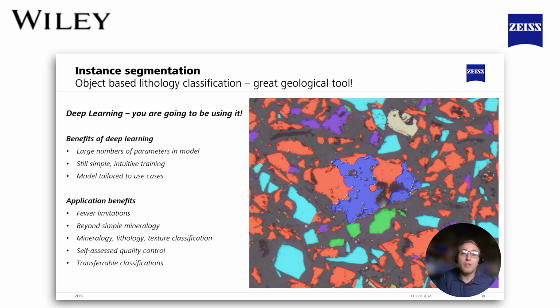Hopefully I've given you an idea of the kind of things that we could tackle, but you could use this kind of image analysis for anything where the shapes are of interest, whether it's stereo microscope images of fossils for hand picking, or fold structures in field photographs. All of these things are just shapes that can be trained and classified and then applied to larger image sets to look at the things that you're interested in.